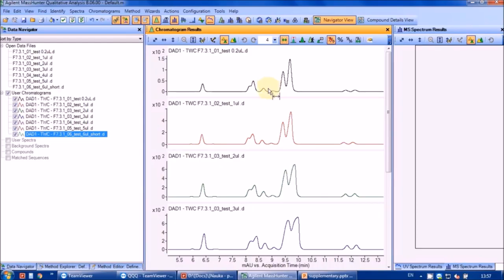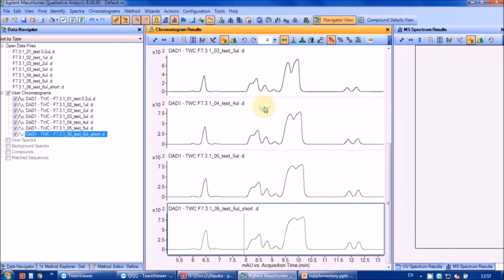waste. On the other hand, high injection volumes lead to column overload, resulting in poor peak shapes and poor separation of closely eluting peaks. Additionally, if the sample is dissolved in a strong solvent, in our case acetone, high volumes will result in partial premature elution, peak deformation, or even peak splitting and poor separation.